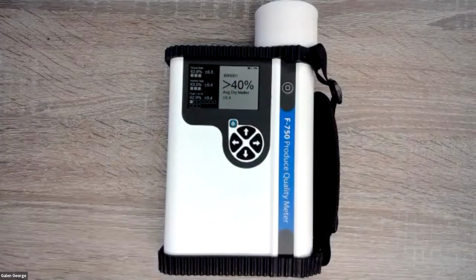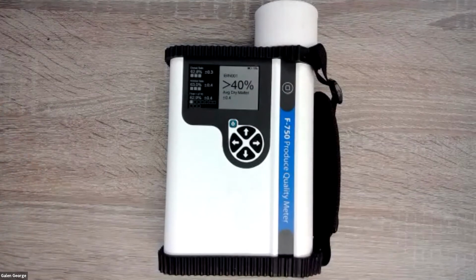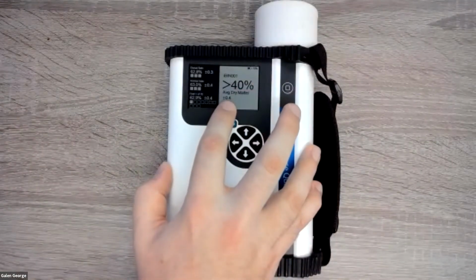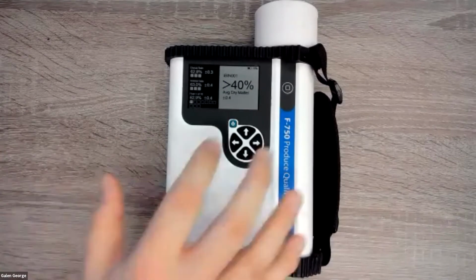What that means is that the more fruit you scan, so if I had 6 fruit within this bin, this number is going to update to be the average of all of the predictions for all the scans of the fruit within that bin so far. So all 6 of those fruit are going to be included in this average. We also now have a standard deviation marker, which is great for seeing things like tolerances. So if you have a set tolerance you want to adhere to, this is a great feature to have.